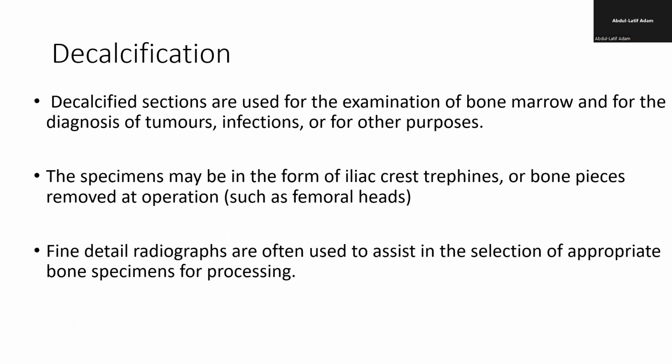So sometimes too, apart from normal tissue that is also calcified, sometimes bring it and then it is decalcified. Okay.